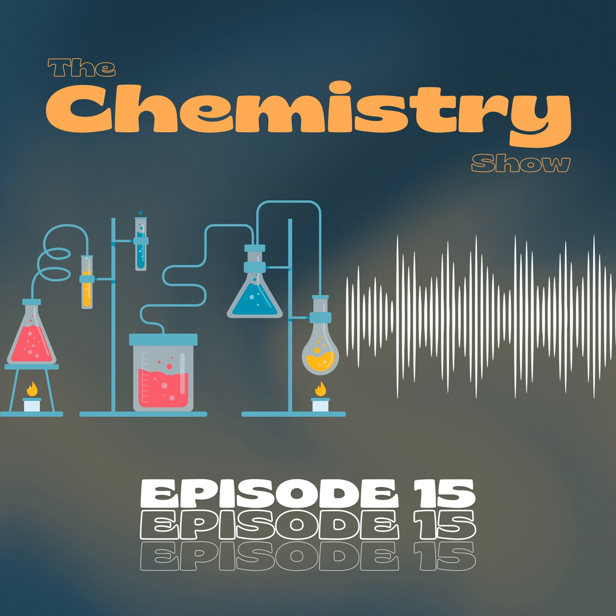And we've got a whole arsenal of tools at our disposal, right from electron microscopy to X-ray techniques. Right. And we're constantly developing new tools and refining existing ones. So it's really a rapidly evolving field. And speaking of amazing tools, there's one more technique that I want to touch on that really takes our vision to the next level, and that's high-resolution transmission electron microscopy, or HRTEM.